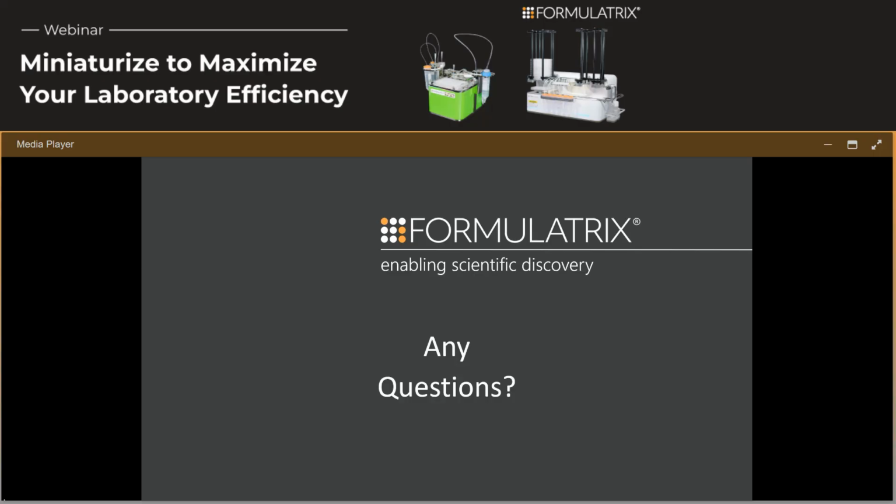So, when the specific direction is not available from the kit manufacturer, I think this can be validated by performing the miniaturized and full-scale reaction in parallel. This method will yield optimal reaction volume for a given experiment while maintaining data quality and integrity. To the next part of the question, yes, Formulatrix has collaboration with some of the most well-known kit manufacturers. One we have mentioned in this webinar is Takara Bio. They have published a quarter volume protocol of their SMARTer-Seq v4, a cDNA synthesis kit.